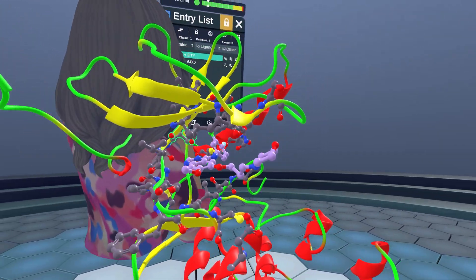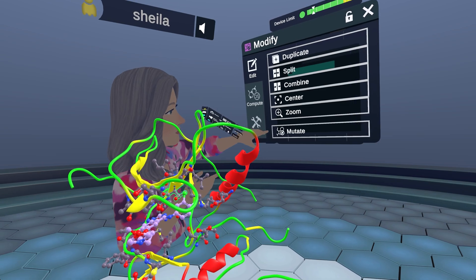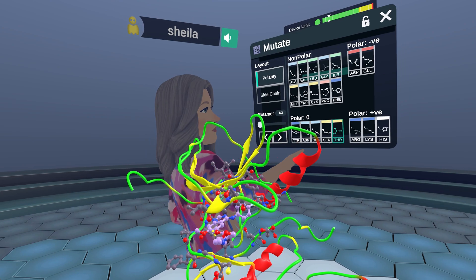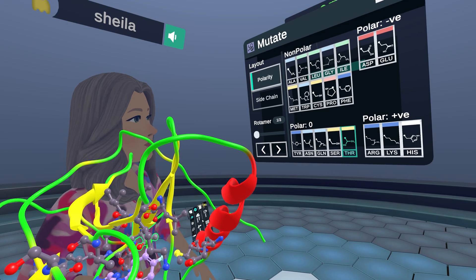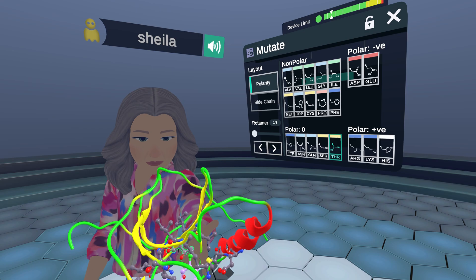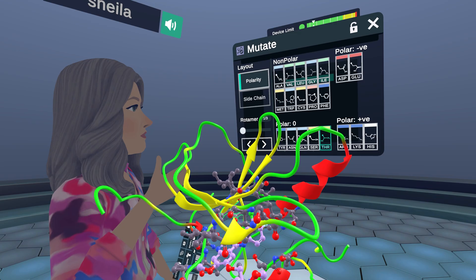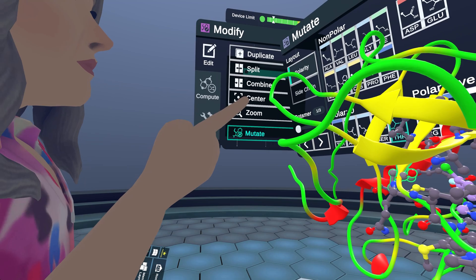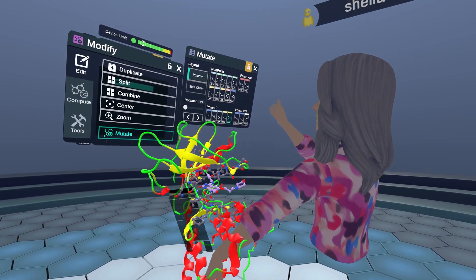To mutate this, we go to the Modify menu and under Edit we see Mutate. This gives us a menu with all 20 essential amino acids organized by polarity or by side chain. Threonine is already highlighted — that's what we have selected, the residue at that position. To change this to methionine, we simply select methionine, and now it has extended and placed it in the protein.